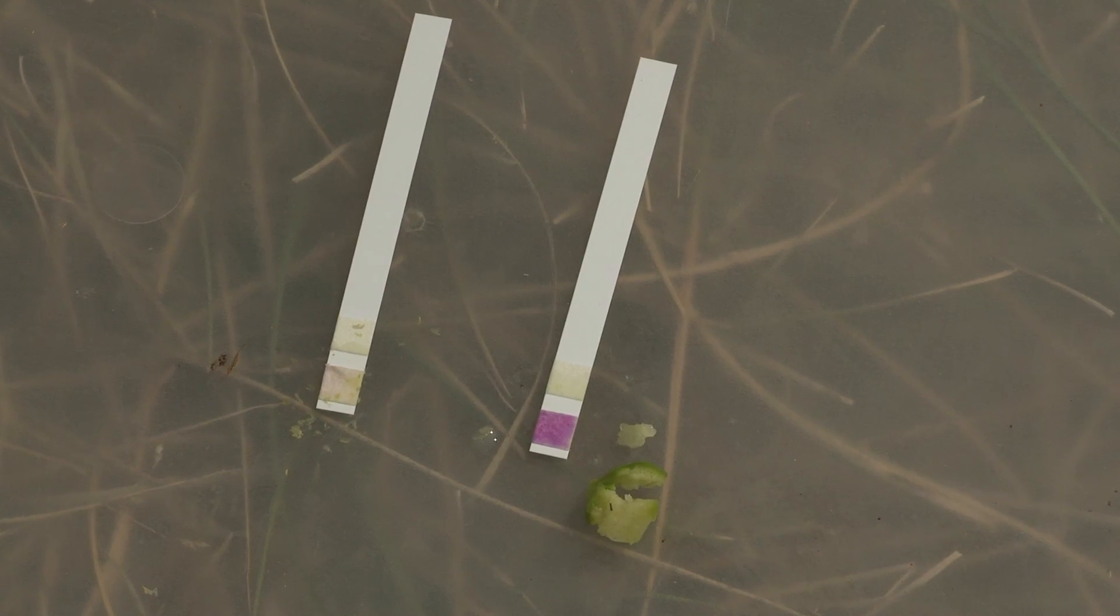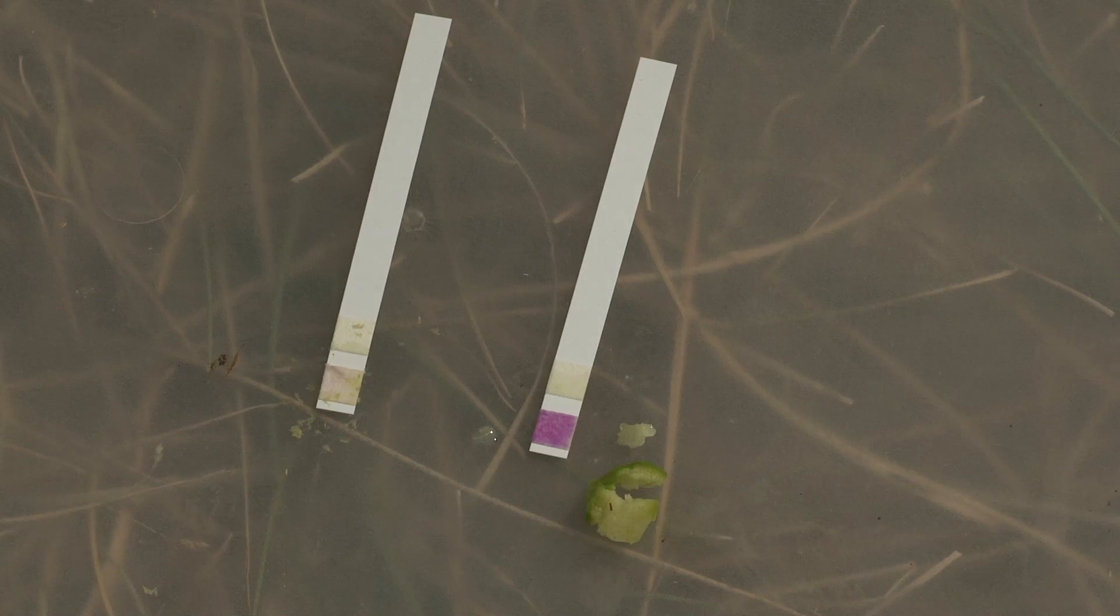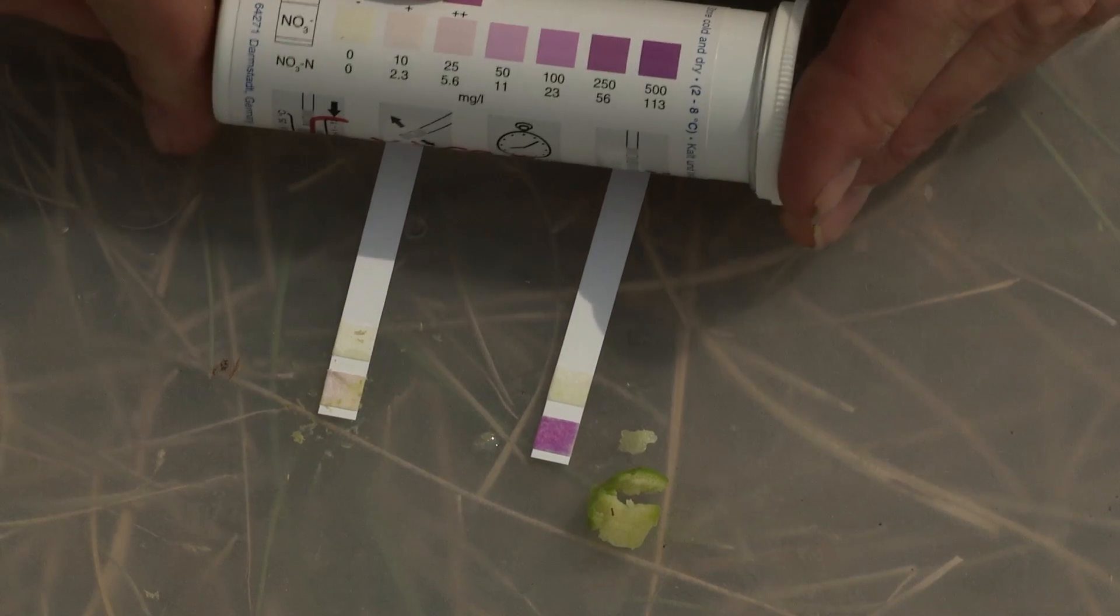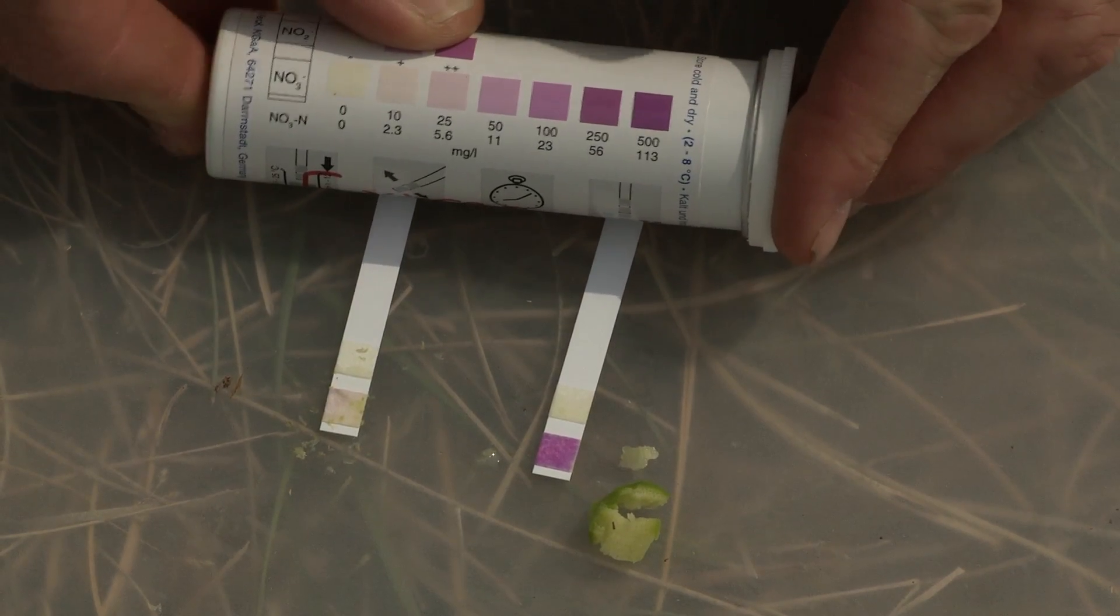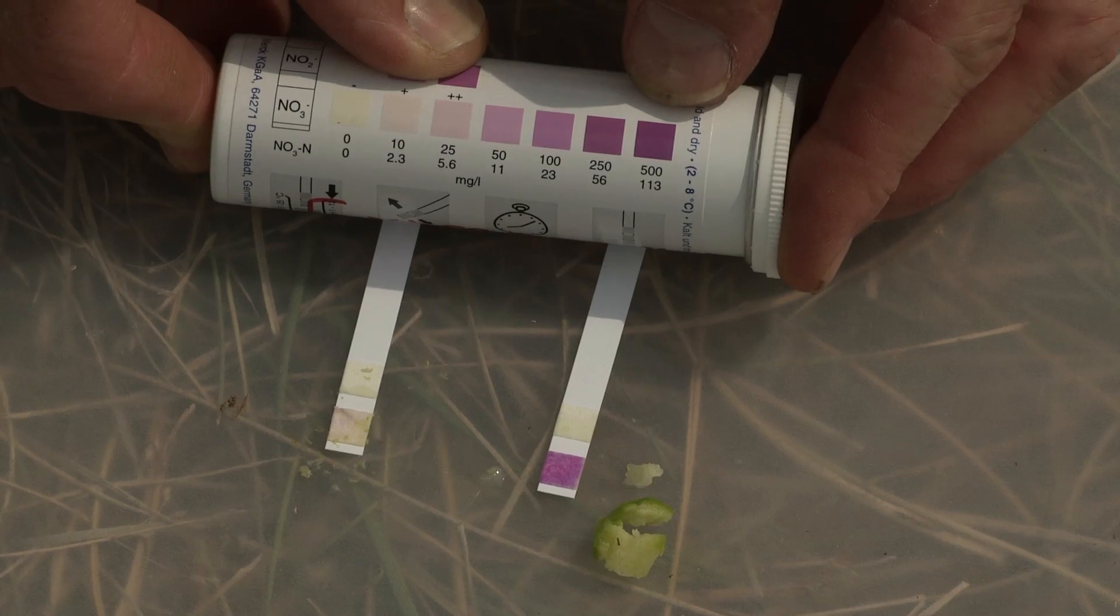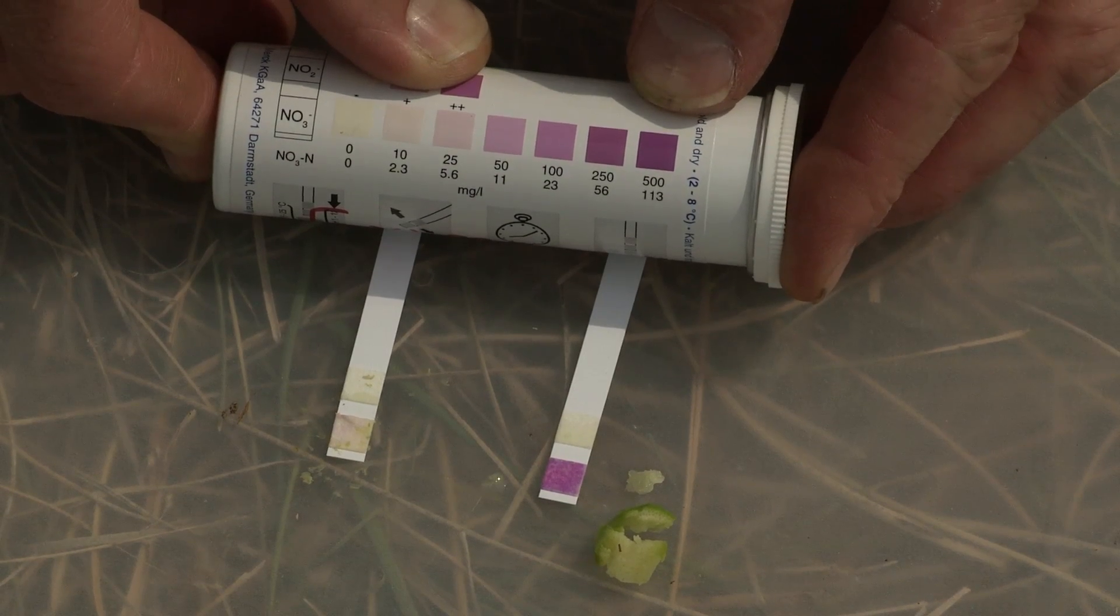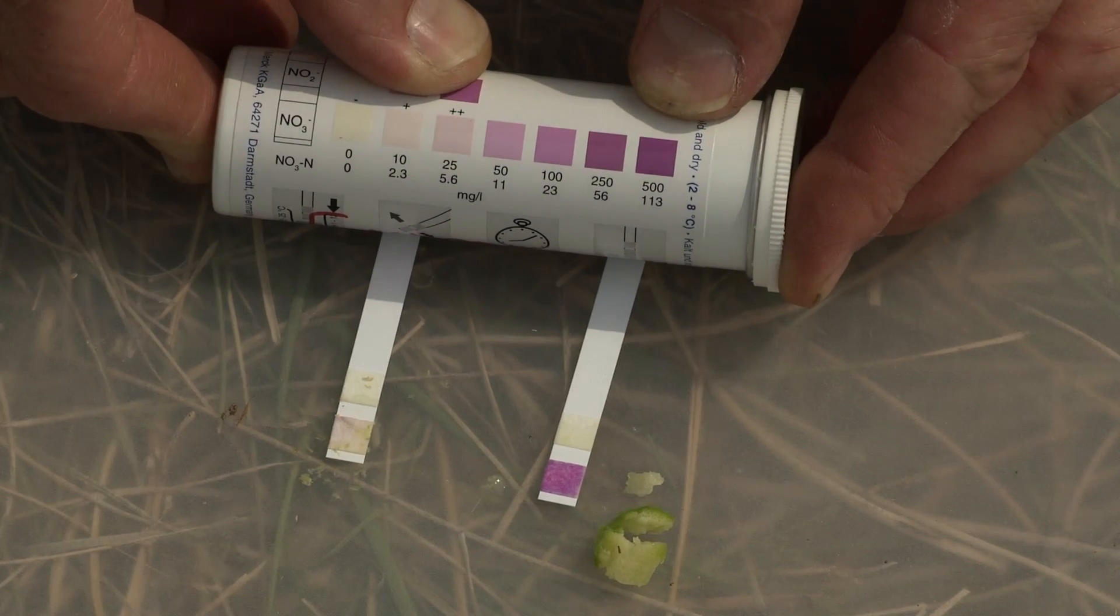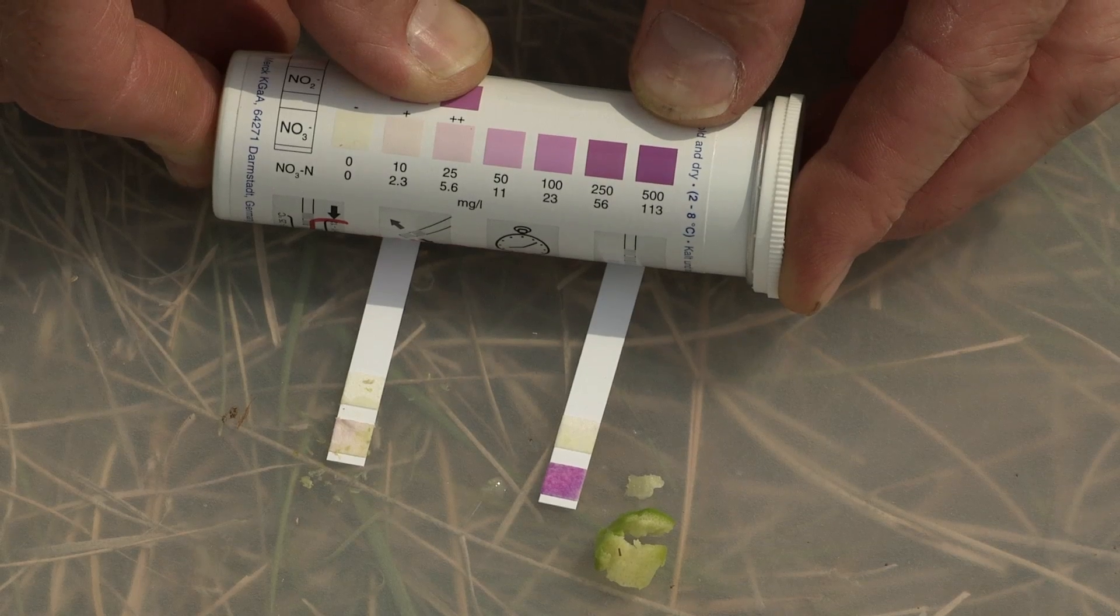With the sorghum, we're seeing a rapid color change. On the vial that these come in, we have a range of colors, and if it goes to this 500 parts per million, this darkest color, within a minute, we know that it's at a potentially toxic level for animals.